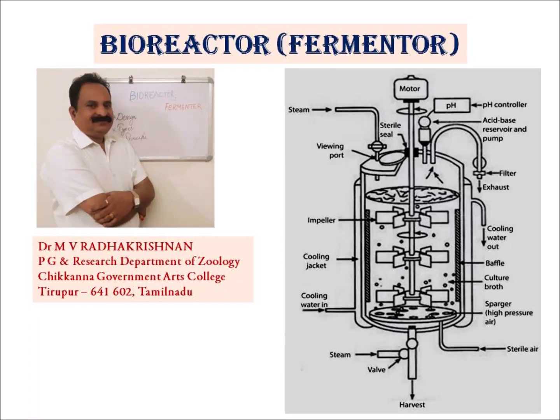Dear students, the topic is bioreactor or fermenter.